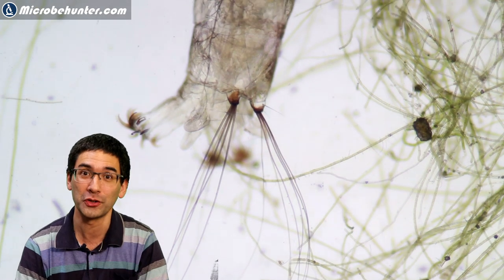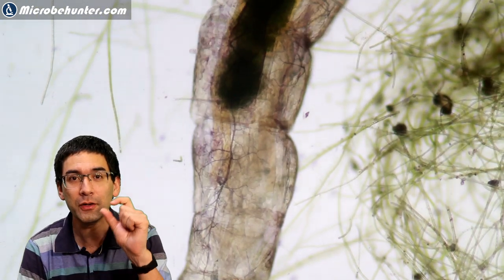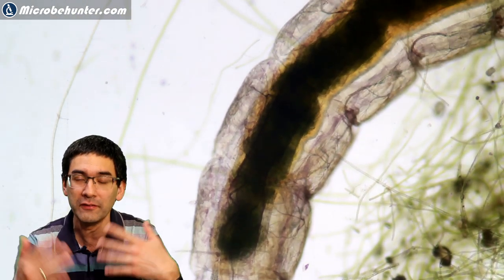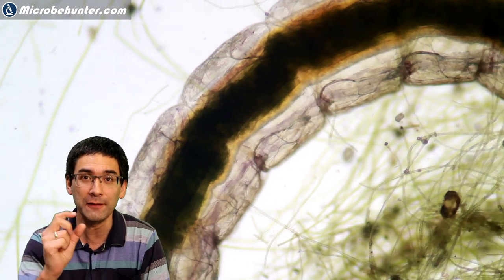These mosquito larvae have a very interesting back end because they breathe air even though they grow and develop in water. This back end is called the siphon.